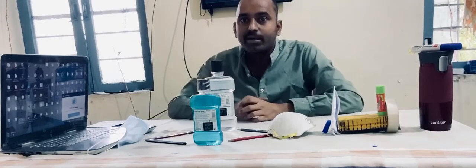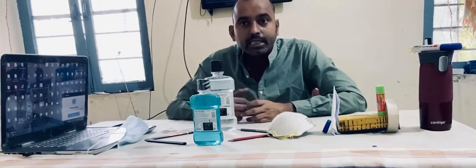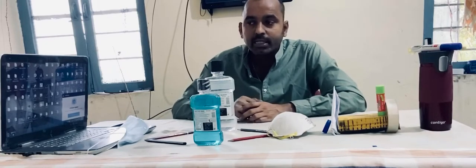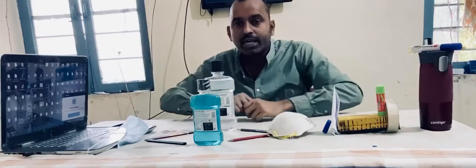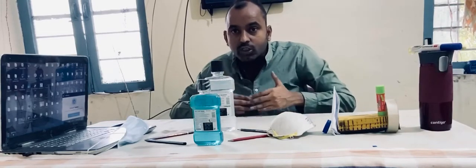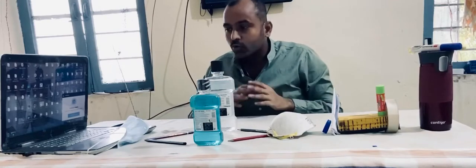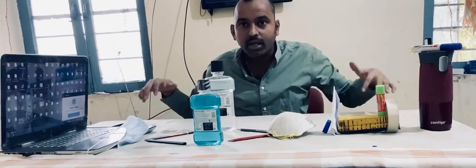This is the fundamental information. It is similar to turbidimetric and nephelometric analysis. In turbidimetry, you measure the light at 180 degrees to the source, whereas in nephelometry you measure at 90 degrees. So these are the fundamental components of your instrumentation, and every instrument contains all of these in one fashion or another.